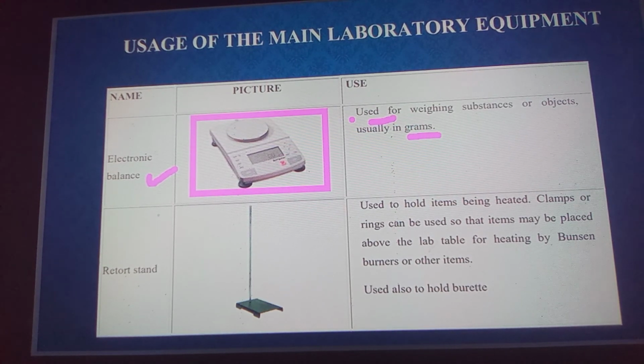It is used to measure the weight of substances in grams. So this is electronic balance.